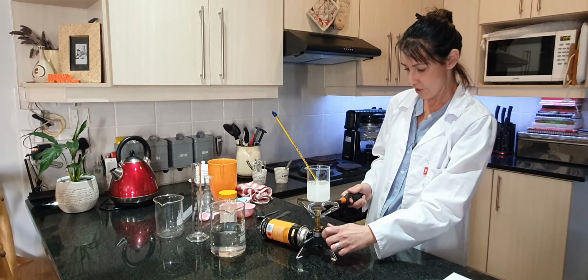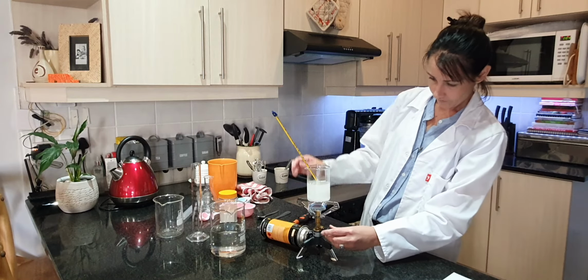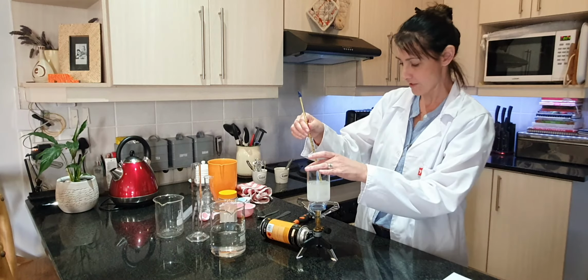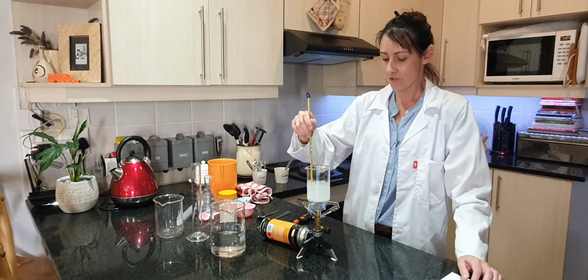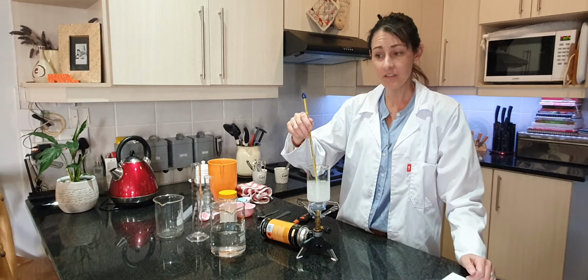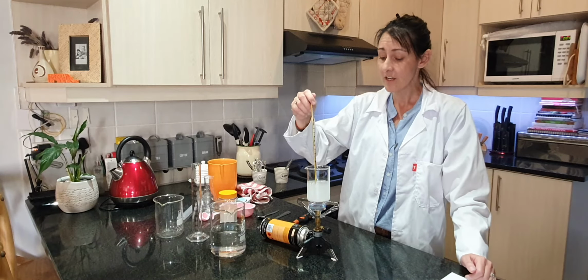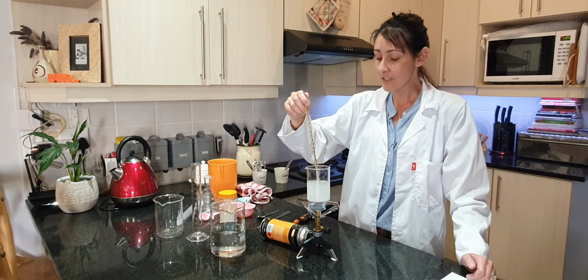Just going to switch on my heat source once again. Okay, making sure it's the same as the previous time. Okay, and let's stir it. So the boiling point for water was 99 or 100 degrees Celsius. If you look it up on Google, it will tell you it's 100 degrees Celsius. So we were very, very close. So you're welcome to use the 100 degrees Celsius.